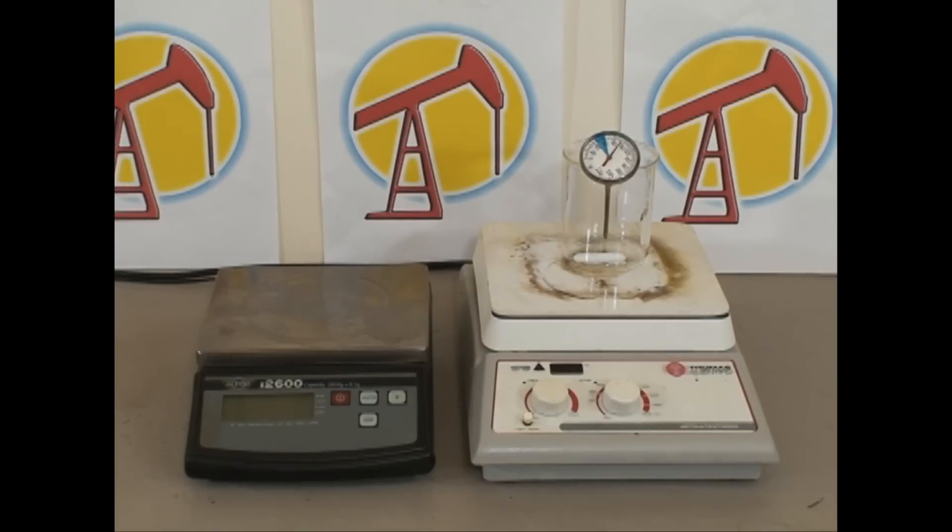On the left we have a digital scale, the equivalent of a triple beam balance. It has a 2600 gram maximum and a 0.1 gram resolution, and it basically has the same functions and capabilities as the triple beam.